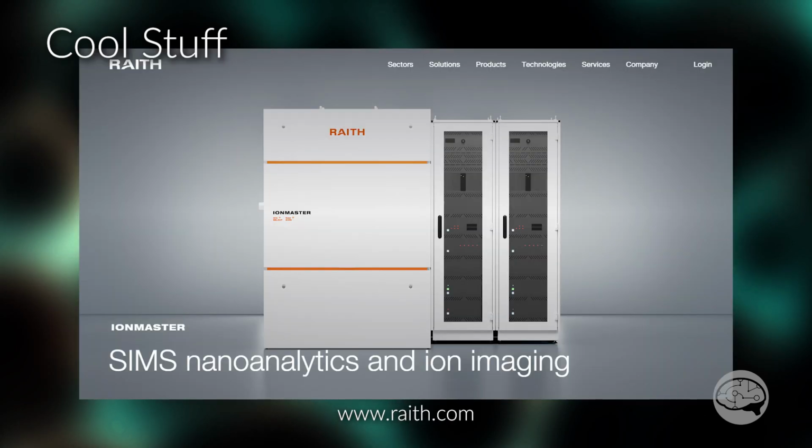Raith America last year debuted this totally wild triple ion source column. It's a single column and 3 ions come off of the filament simultaneously, and then by biasing one of the coils in the column, you're able to only get one of those ion streams to hit your sample, and so you could switch between them very quickly. Totally wild. Crazy stuff.